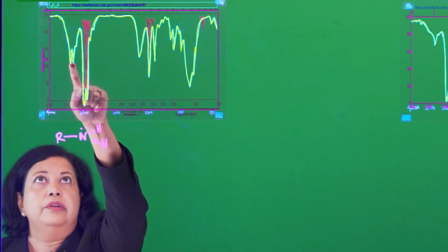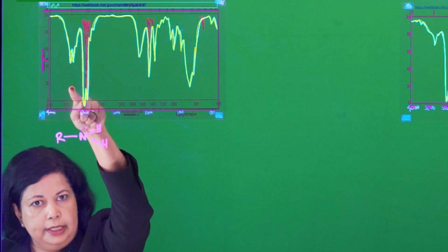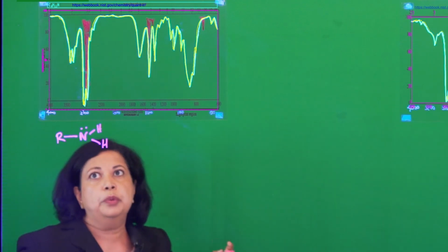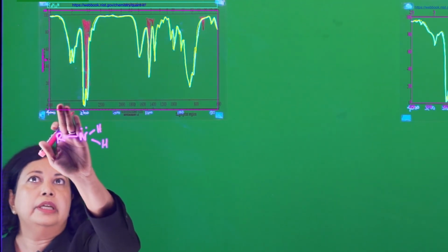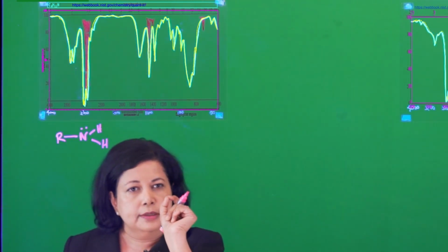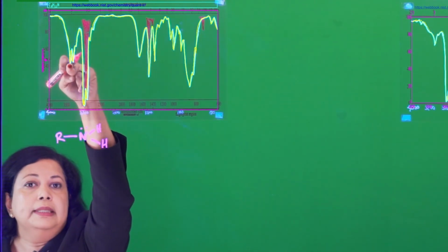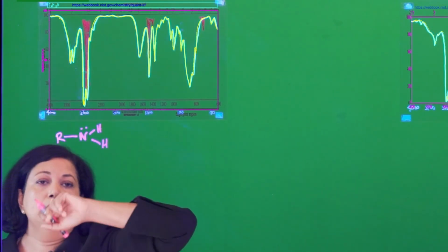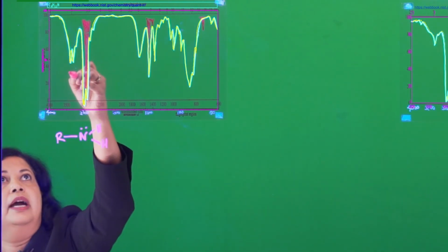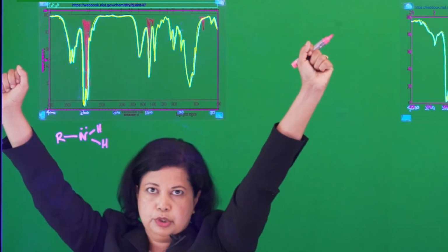First of all, two very prominent peaks. They're not strong in the sense that they don't come all the way down here. They're kind of medium, all right? And that's two peaks, and you know it's in a very high region, so most probably it's attached to hydrogens, because the mass goes down, the wave number goes up. So these are CHs, these probably are NHs, and they are NH bonds, and you can do the same calculation and figure out where they would be. And you have two of them. Why? Because you have two NHs. You can have symmetric stretch and asymmetric stretch.